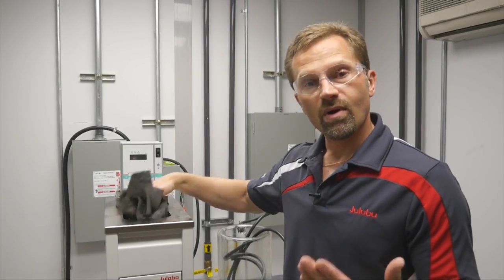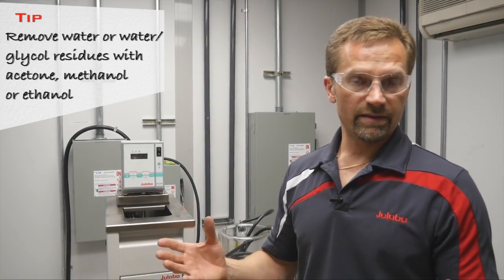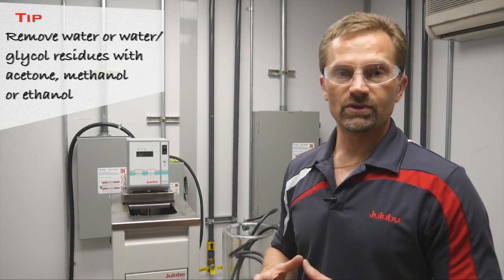If you were going from water or water glycol to silicone fluid, then you would want to rinse the system out with acetone or ethanol, dry it out as much as possible, and then it should be fine for using the silicone fluid.